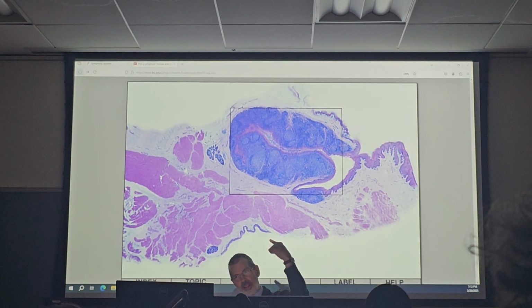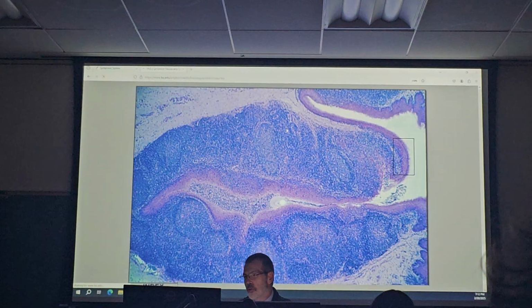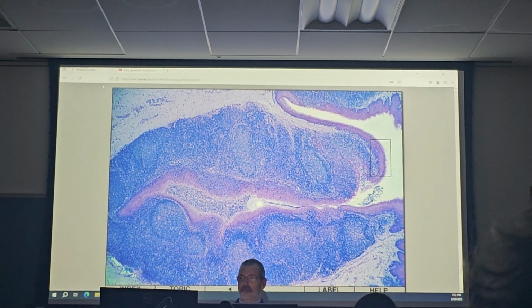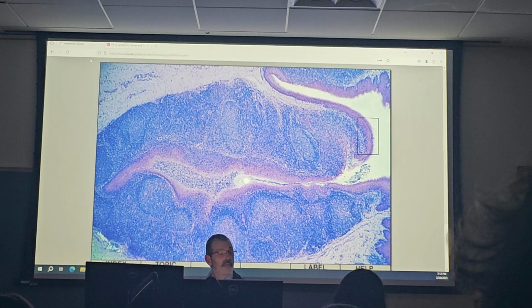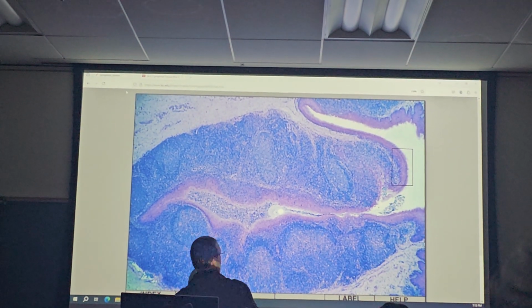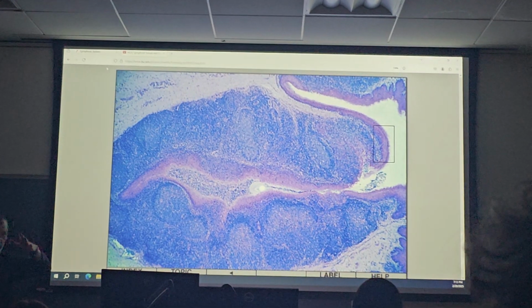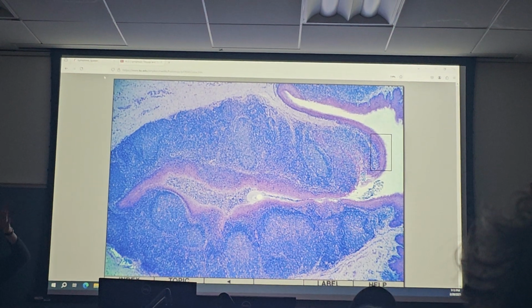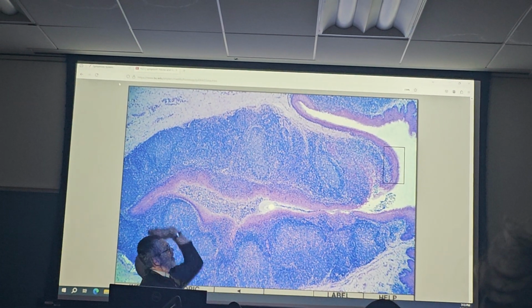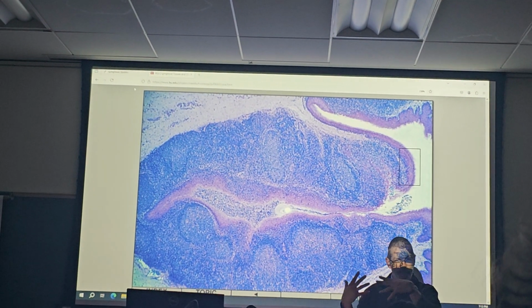That thing in the box up there, that is a tonsil. We're going to zoom in on it. I want you to notice something. What makes this different than all the others you saw? What's something you see that's kind of peculiar? It has an opening. There's a little hole over here, and there's this kind of gullet-looking thing. So we say they have a mouth. It's not really their name, but it looks like a caterpillar that's folded on its side. So we have this opening, and it looks like you flop this over itself. So tonsils have that floppy caterpillar kind of appeal to it.